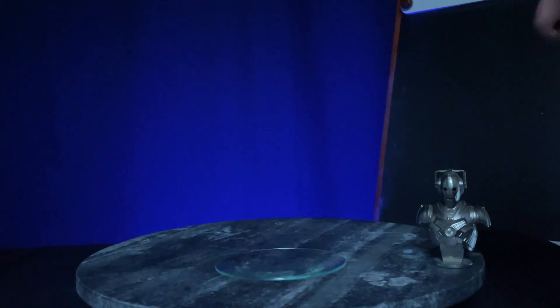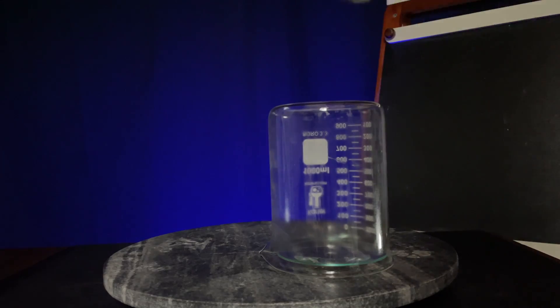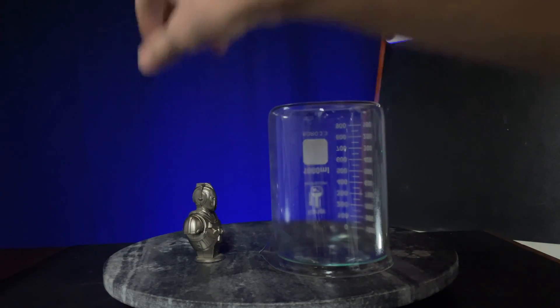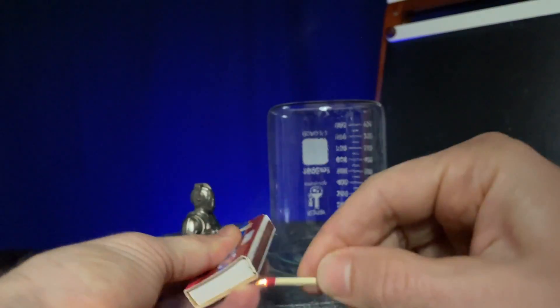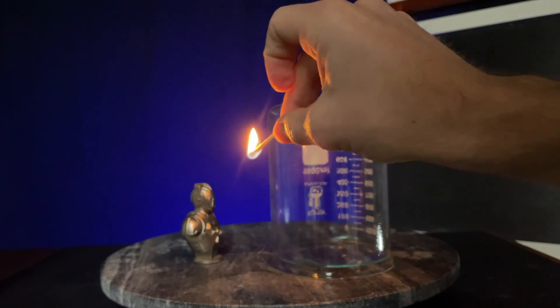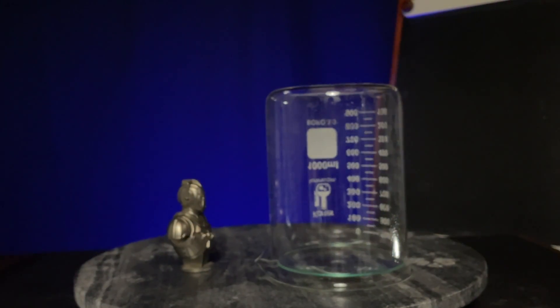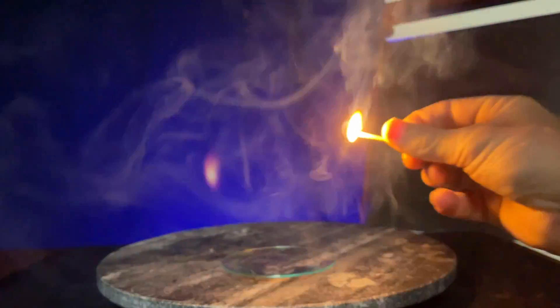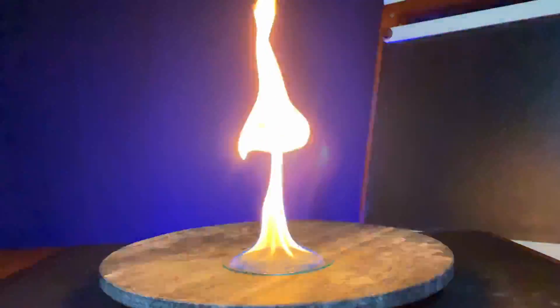Hot flammable things are extremely dangerous. To see just how dangerous, watch this. I'll blow out the alcohol and cover it with a jar. Imagine you add a flammable substance in an enclosed space. I'm going to attempt to light a match — all I'm going to do is throw the match in front of the lip of the jar. Is that not a little scary? Always work with flammables in well-ventilated areas, because those fumes are really reactive due to the high oxygen exposure.